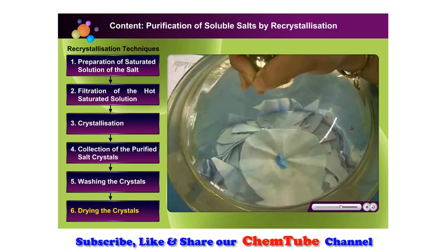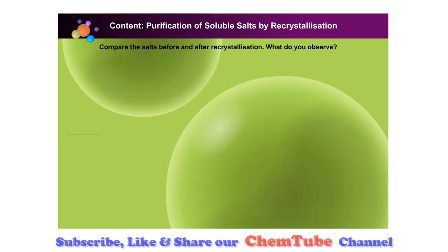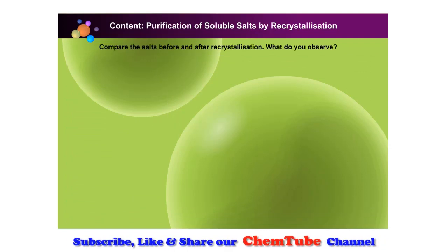You have successfully prepared a pure salt from its solution using the recrystallization technique. Compare the salts before and after recrystallization.